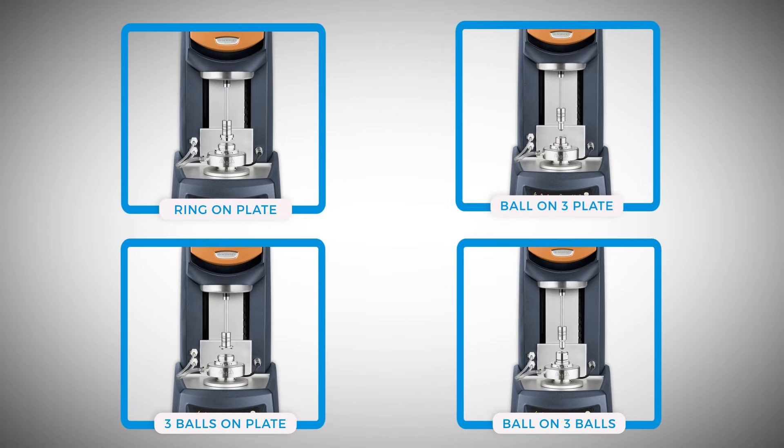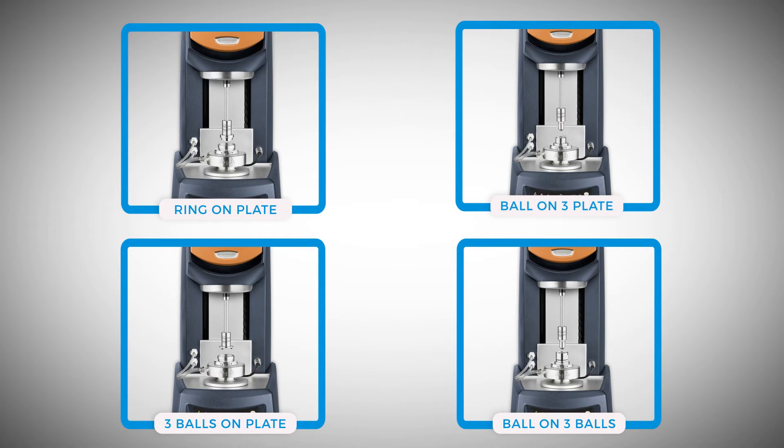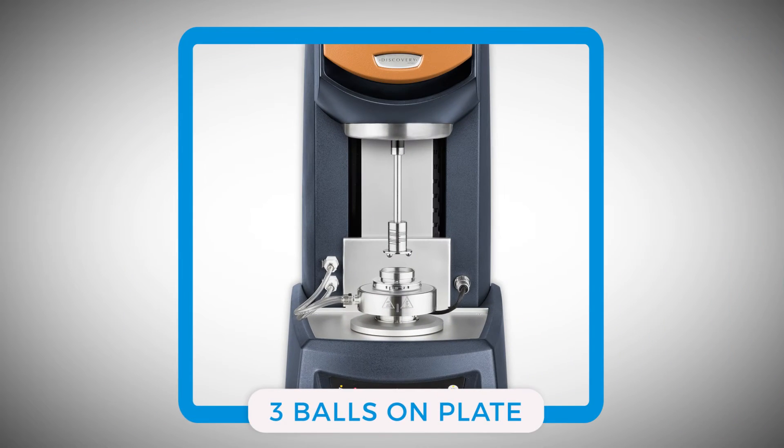The TA Instruments Discovery Hybrid Rheometer is equipped with four different types of triboreometry accessories. Among them, this three balls on plate geometry provides the capability of testing the coefficient of friction on a solid surface such as coating.